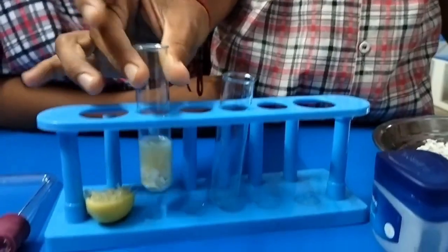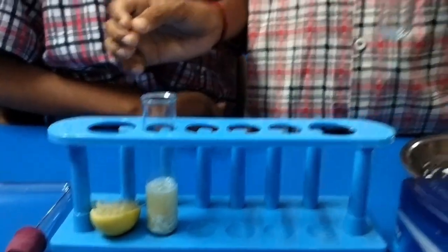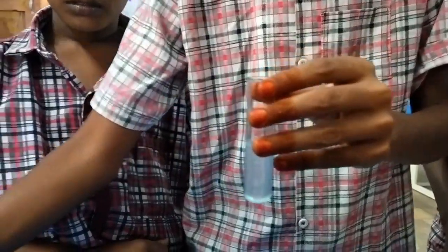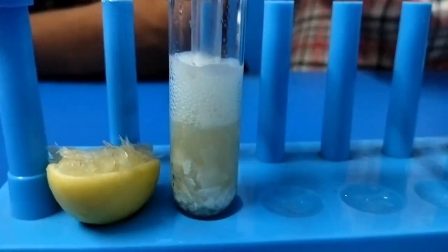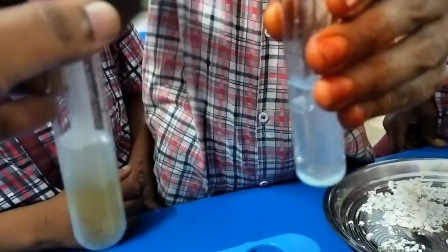Now take another test tube and pour lime water in it. Keep the U-shaped glass tube in the first test tube like this. The end of the tube should not be submerged in lemon juice. The other end of the U-shaped glass tube should be immersed in the lime water, like this.